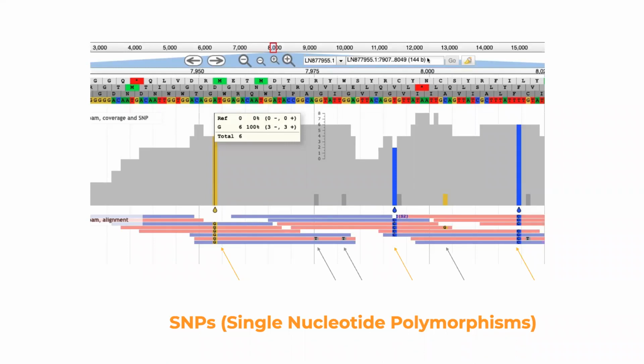Remember, so here, if you did your Genomics 1 course, you will see that you can actually search for a specific gene or a position, navigate to there from there, and we can understand what exactly are these different types of changes. Okay? So these are called single nucleotide polymorphisms. Typically, we call them single nucleotide variants, polymorphisms, mutations. They're different terms, and they are different. They are used differently in different contexts.